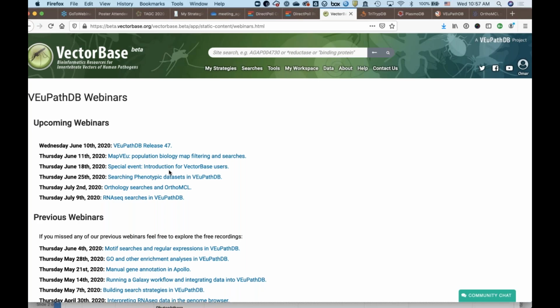This webinar will be relevant to you too, because we'll be describing and showing tools that are available everywhere, in all the resources. So we may be running an analysis on Anopheles gambiae, but you can run a similar analysis on Giardia, for example, or Cryptosporidium or Microsporidium, or various fungi. And so that's the nice thing about having resources that use a unified way of analysis.